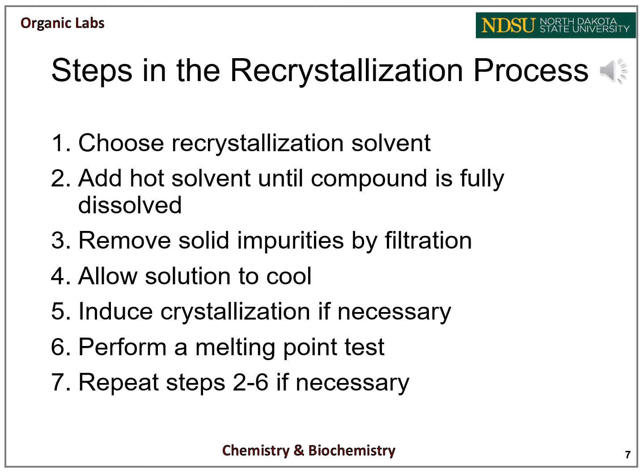Step 6 is to perform a melting point analysis to compare your crystals to known literature values if it's a known compound. And then step 7 is to repeat steps 2 through 6 if the crystals are not as pure as necessary.